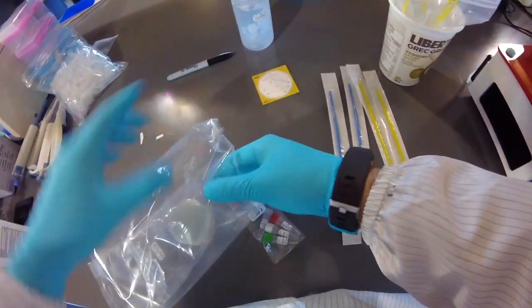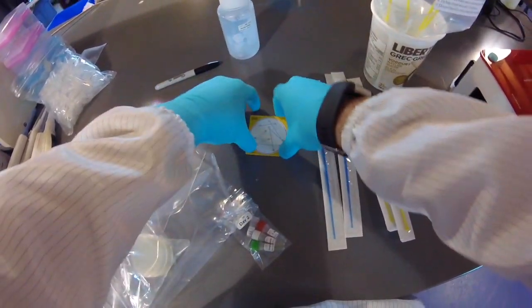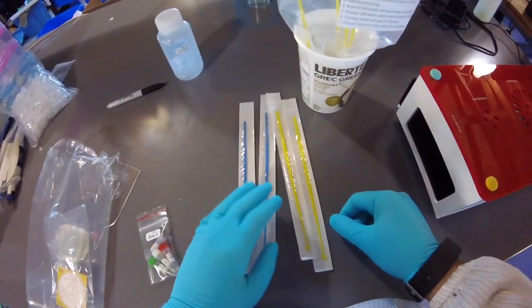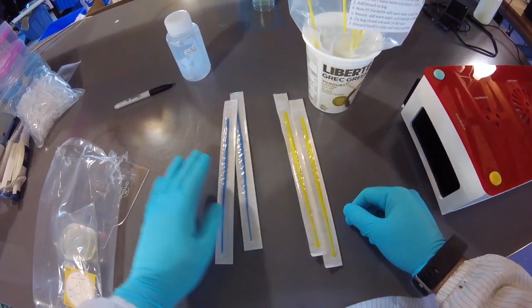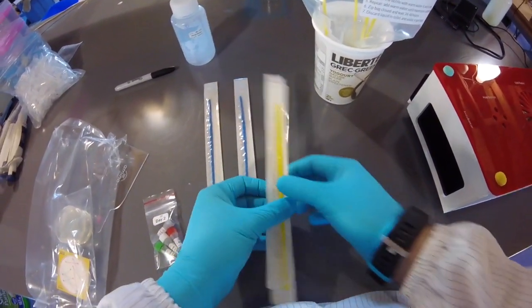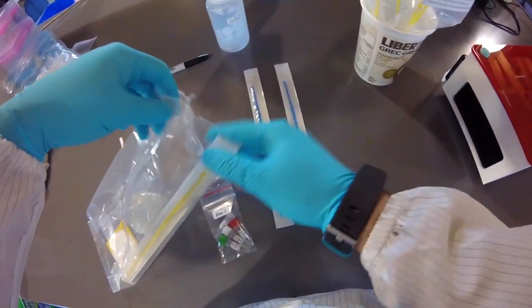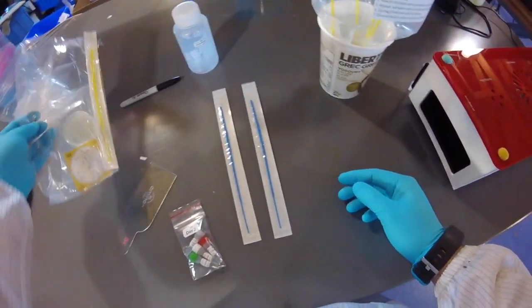So I'm just going to put these back. We're not going to need these today. We're not going to need our streaking stencil. You can hang on to that, use it for other times, and we're also not going to need these. We're going to be using these loops tomorrow when we streak our cells onto these plates. So I'll just leave those in there.